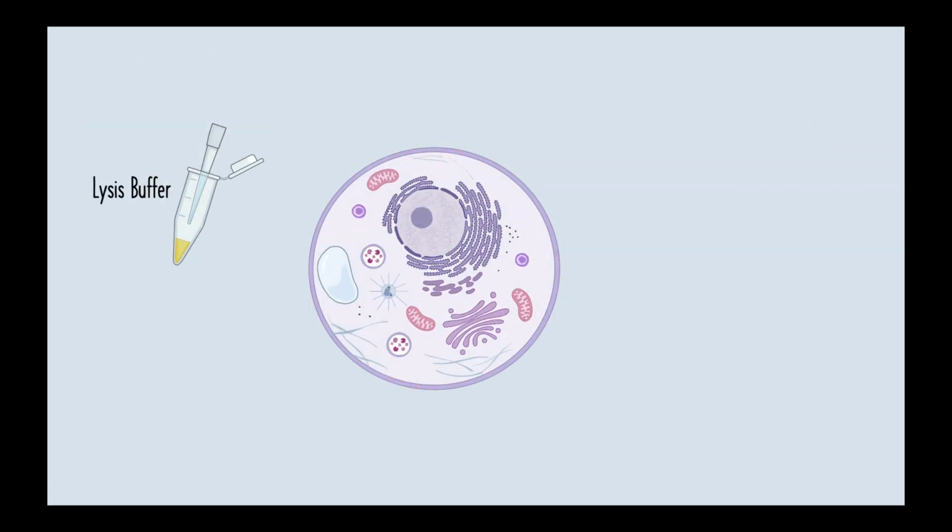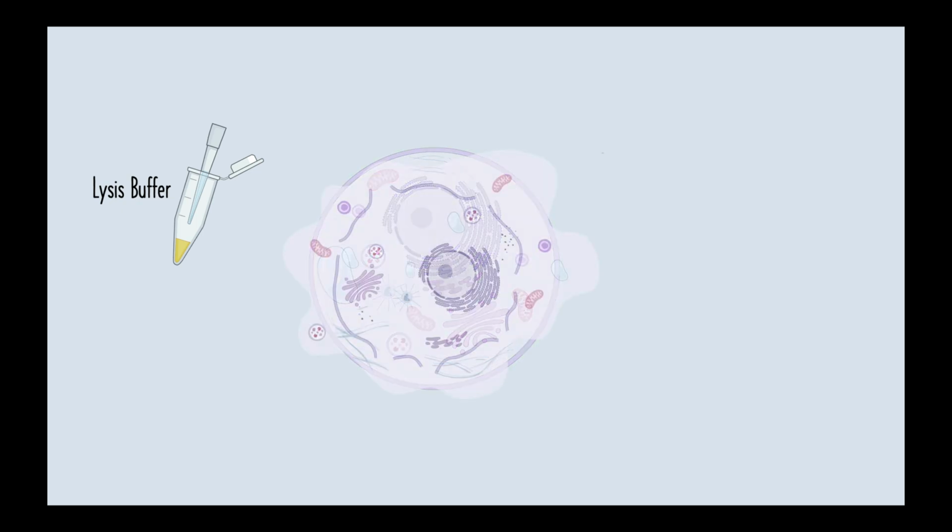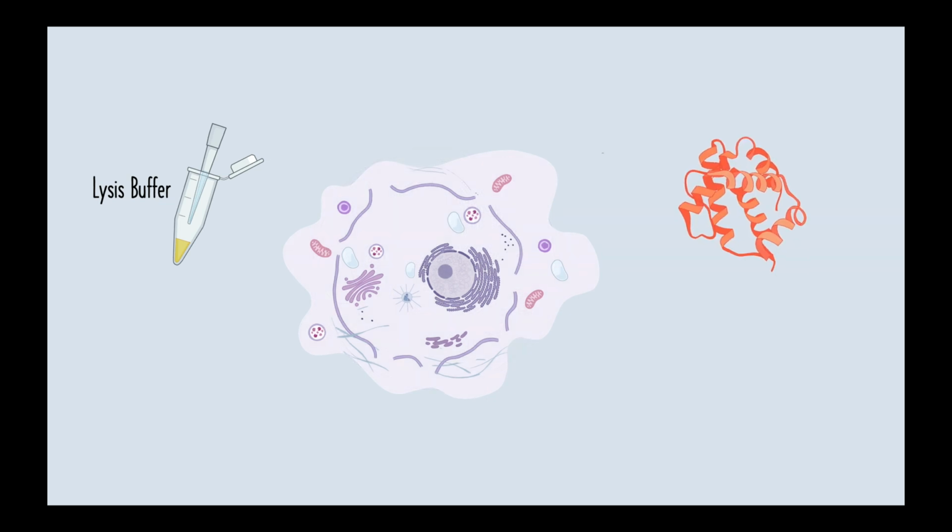Understanding what goes into a lysis buffer is the first step toward optimizing your protein purification process and ensuring success in your downstream applications. A well-chosen buffer not only helps release proteins from cells, but also maintains their stability and functionality throughout the experiment. A typical lysis buffer contains several key components, each serving a specific purpose.